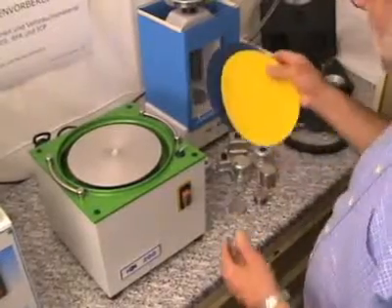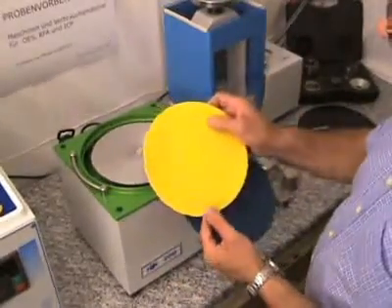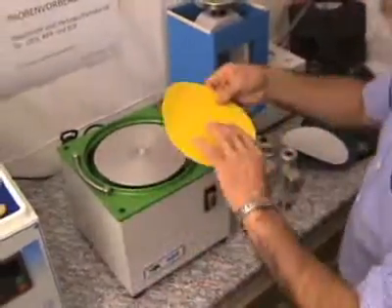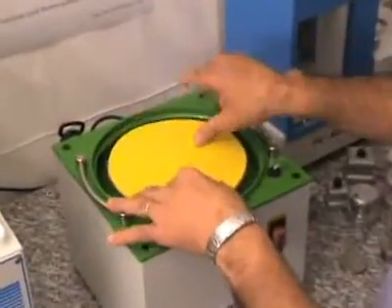The grinding papers are self-adhesive. The blue one is zirconium oxide and the yellow one is corundum. The grinding paper is fixed onto the grinding dish.